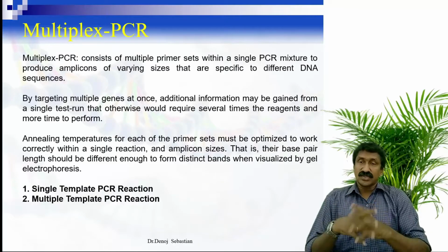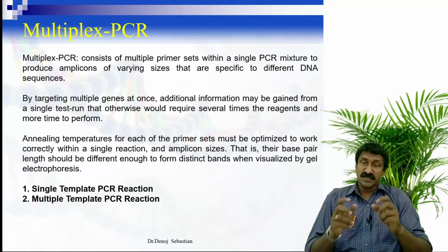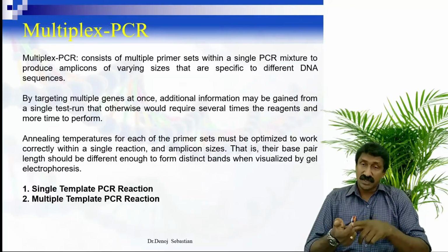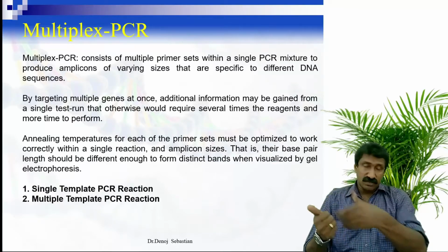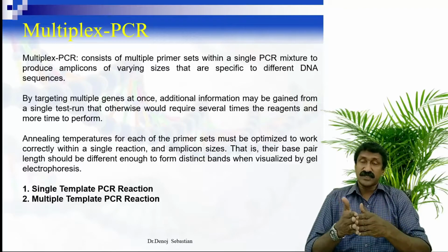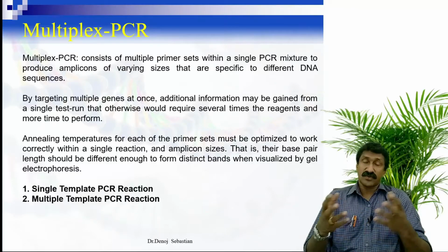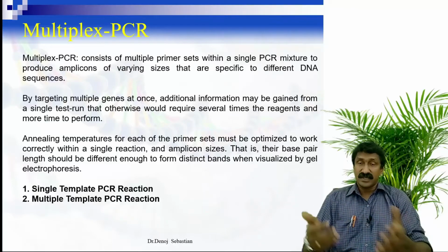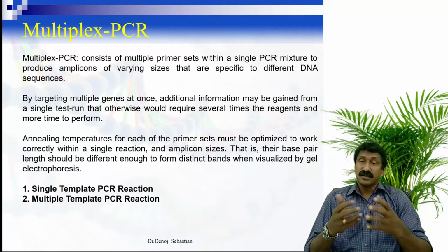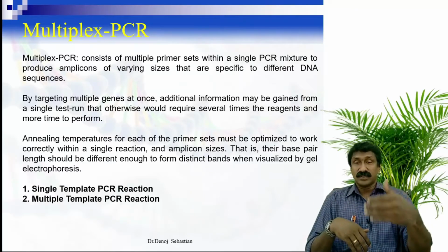Whereas if you have a mixed culture in which you extract the entire DNA, that culture may contain E. coli, Pseudomonas, Salmonella, or 3 or 4 organisms. You can design specific primers against E. coli, Klebsiella, Pseudomonas, or Proteus, maybe. 4 different organisms can be simultaneously amplified. That specific DNA sequence can be simultaneously amplified in a mixed culture, or for example, a water sample or some other environmental sample, where the DNA is totally extracted, and you target that multiple template DNA sample with the concerned primers.